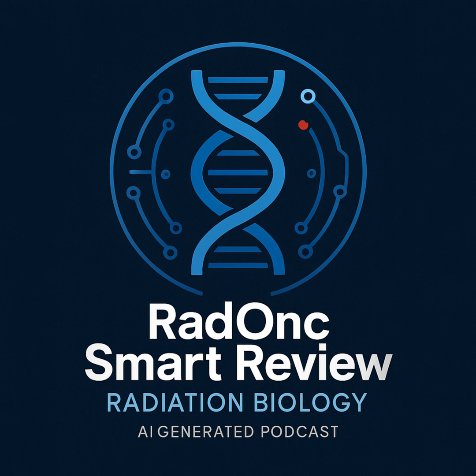What else is there? There's the lung colony assay developed by Hill. This one's interesting because it relates to metastatic potential. How so? You take your tumor cells, again from control or irradiated donors, but this time you inject them intravenously. To the bloodstream. Right. They circulate. And some will get trapped in the capillaries of the lungs. If those trapped cells are viable, clonogenic, and can actually grow in that new lung environment, they'll form metastatic colonies in the lungs. Exactly. After a few weeks, you examine the lungs and count the visible tumor colonies. The number of lung colonies reflects the number of injected cells that were capable of surviving, lodging, and proliferating in the lung. So it tests not just survival, but also aspects of the metastatic cascade.